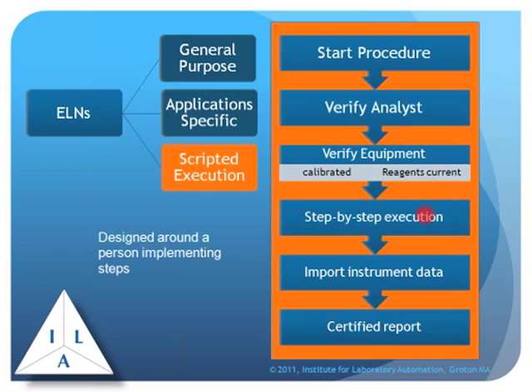And then it brings you through a step-by-step execution of all the test work that's being done. If you're doing weighings, it will record the information from the balance, or else if you can't do it automatically, you enter it in manually. It imports instrument data from a variety of sources and then generates a certified report. But it's all geared towards work for a human being. It doesn't work with automated systems.